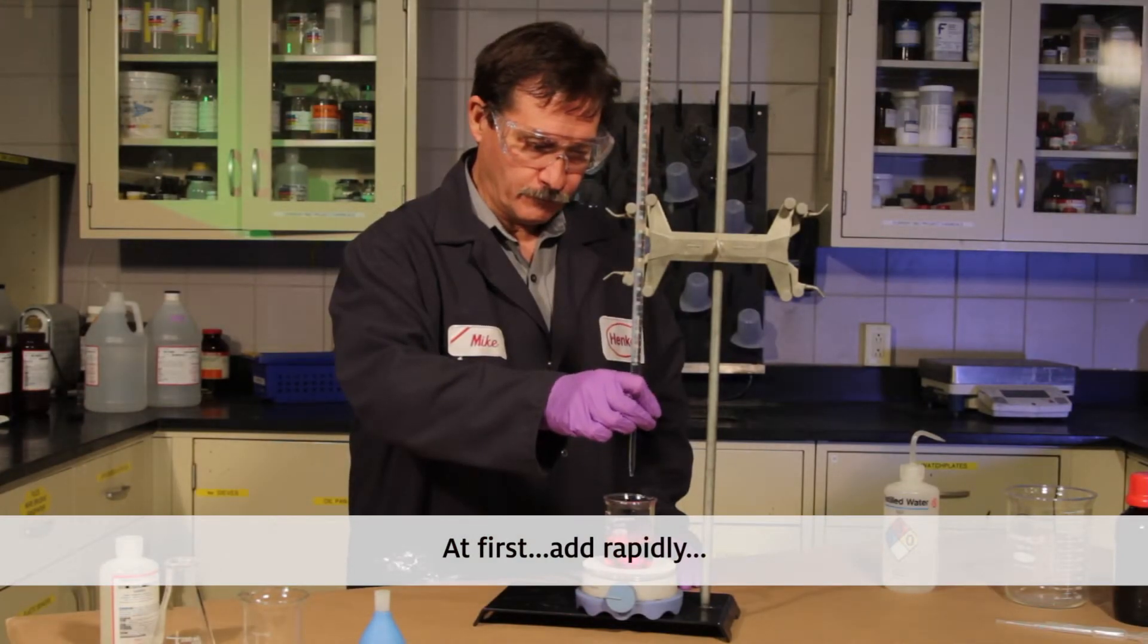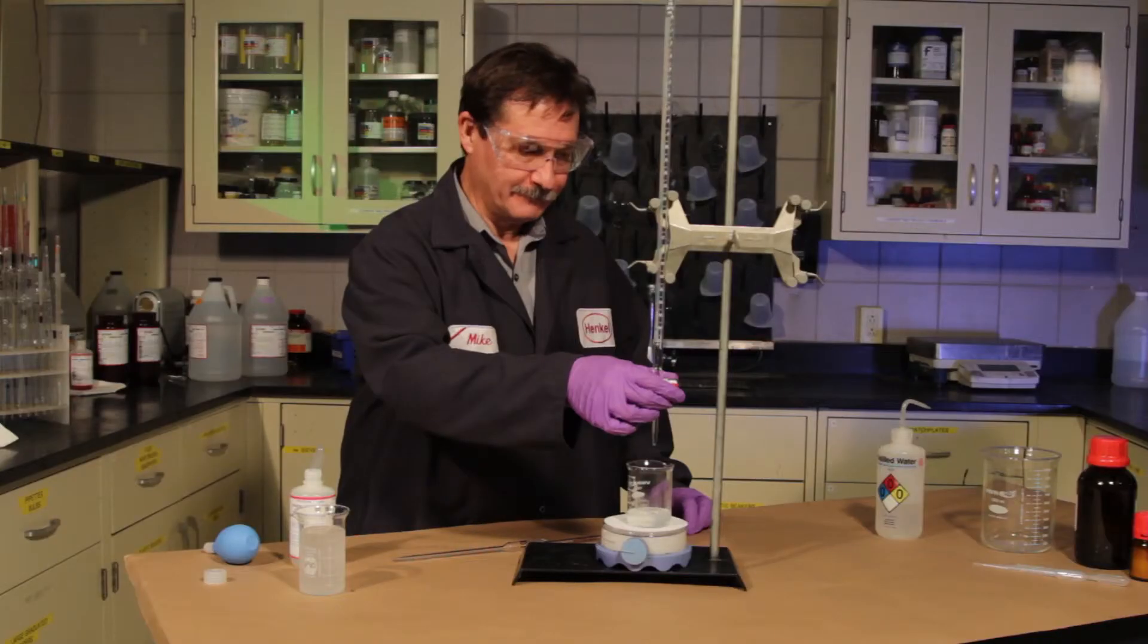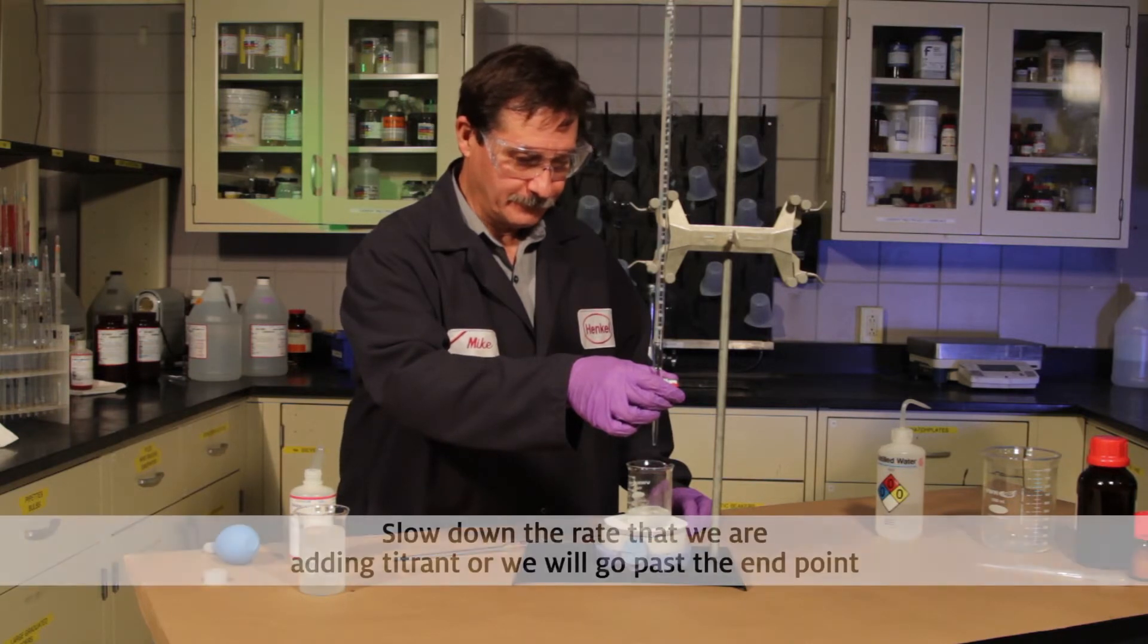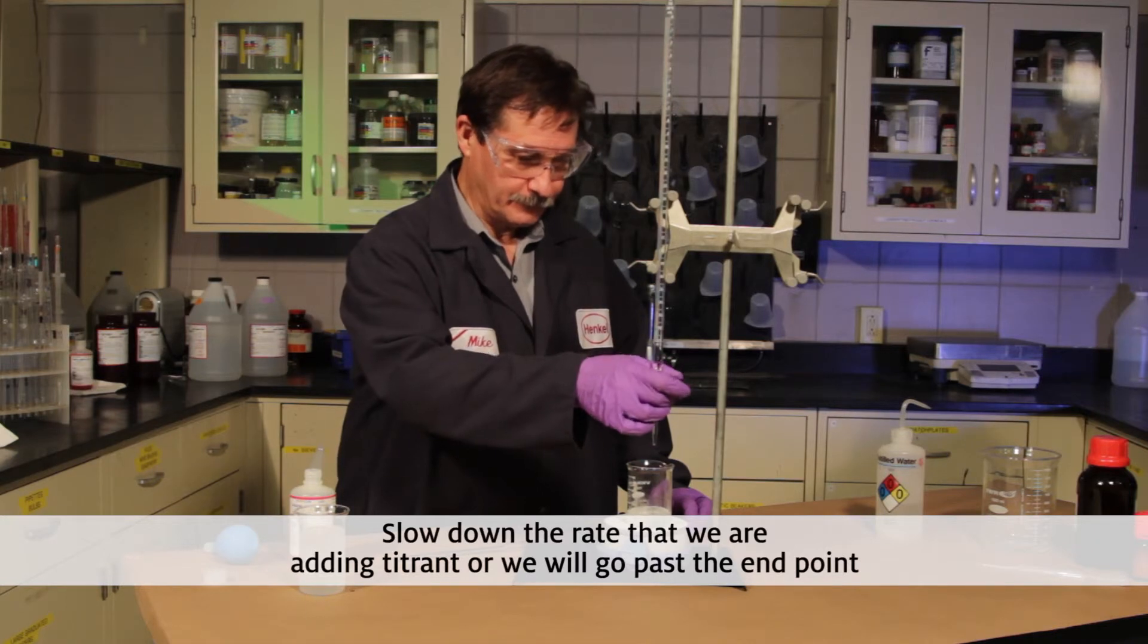Then, as we approach the endpoint, we will begin to notice the color may change for a moment, then change back as we continue mixing. Once we begin to notice the indicator changing color, we need to slow down the rate that we are adding titrant, or we will go past the endpoint.